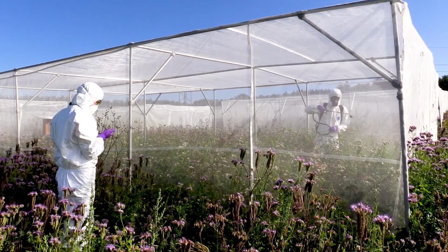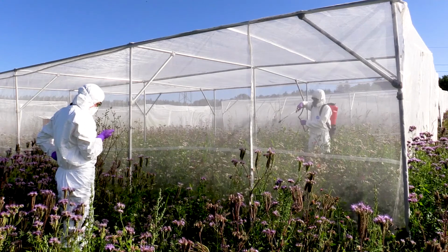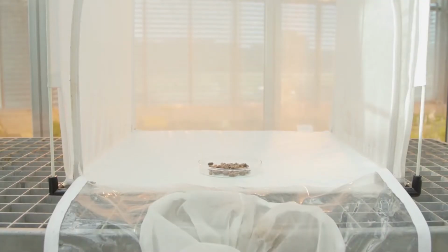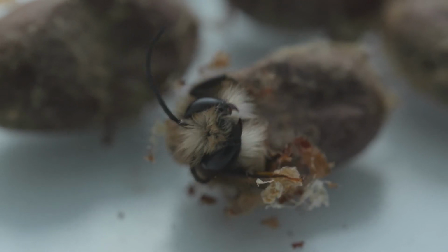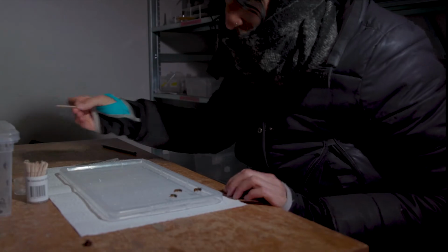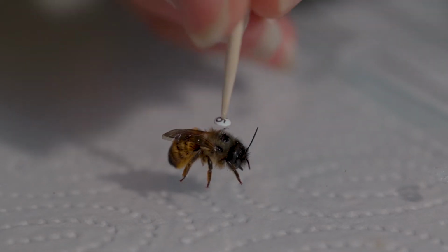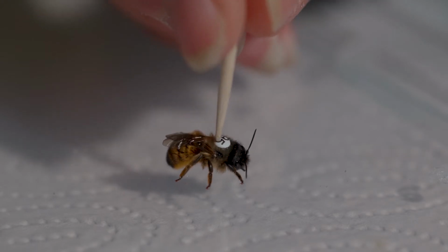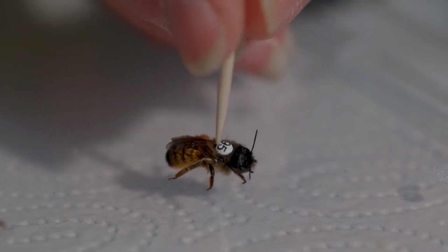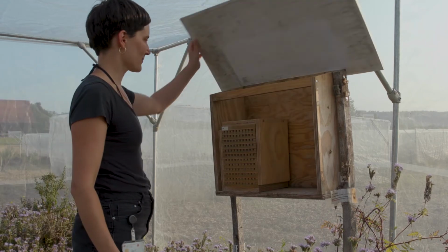This is a semi-field experiment that investigates the effect of a pesticide on the cavity-nesting solitary bee species Osmia bicornis. Before bees are released into the flight cages, they are hatched under standardized conditions. Because individual bees shall be tracked in this experiment, we mark them with unique IDs that are produced for honey bee queen rearing. The nesting unit used for this experiment offers about 5 nest cavities per released female bee.